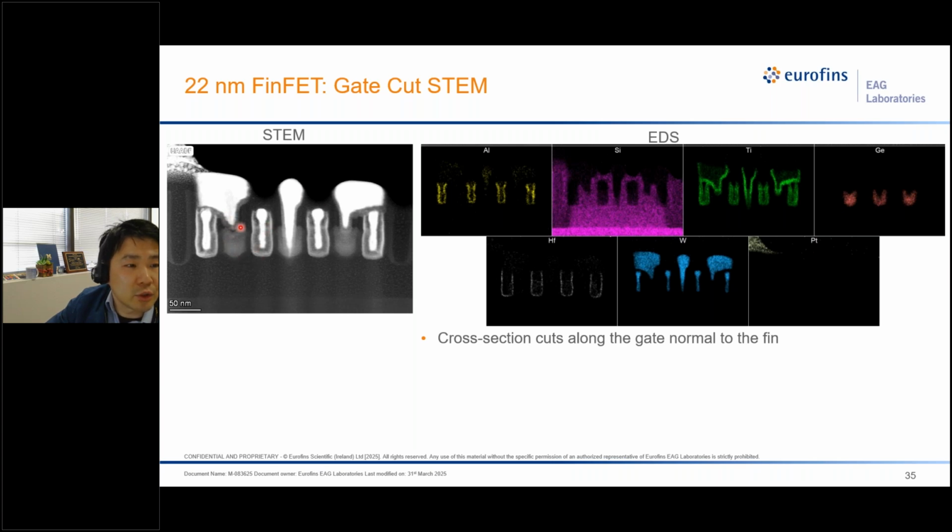So we have 3 silicon germanium regions in this portion, and between the tungsten contact to the SiGe, they also have a layer of titanium, which doesn't show great contrast in the image. There are also other elements in the EDS, like these 4 sets of rectangular shaped regions are the gates. The gates have a center of tungsten and are wrapped in aluminum, titanium. Then they have the hafnium that is from the high-K material wrapping on the fin.